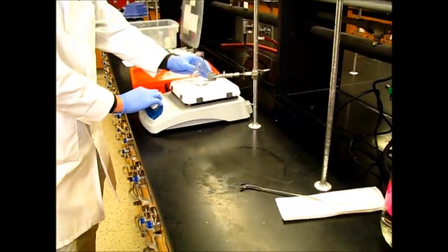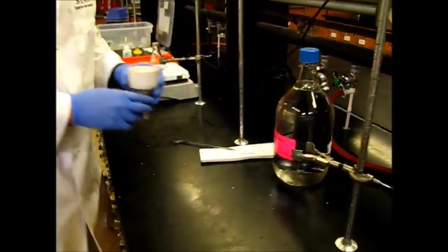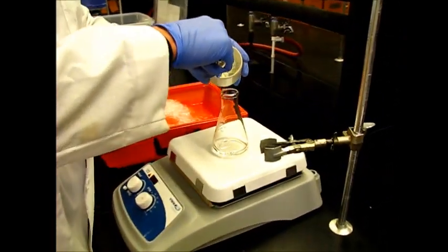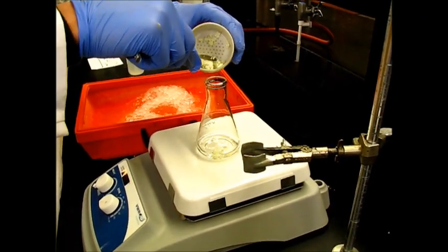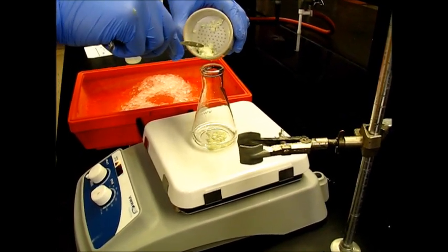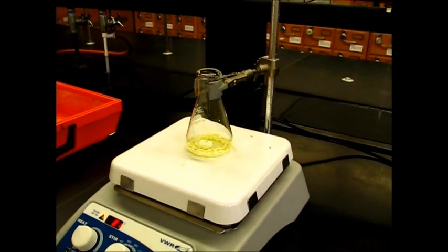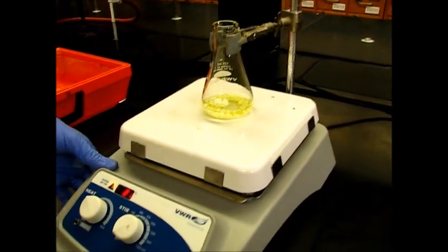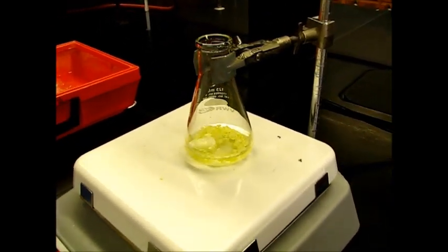We're going to heat this up to make our product a little bit more soluble, and then we're just going to add this straight into our ethanol. We have added everything — the crude compound — and we'll go with slow stirring so that we can dissolve all the crude compound.